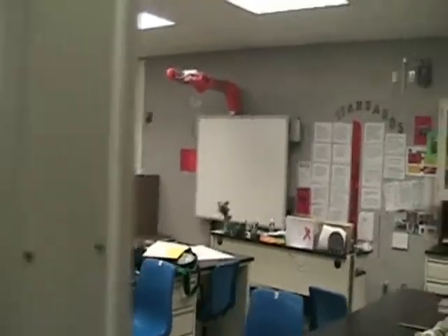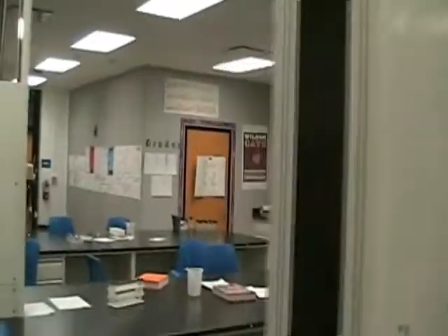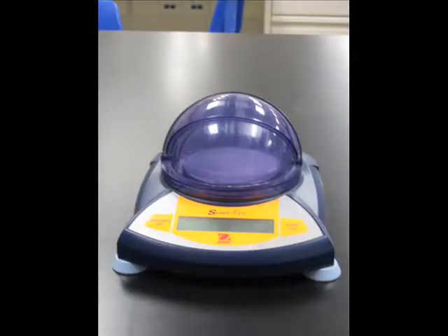Now let's get started with the training. To keep up with today's technology and simplicity, the Biotech Lab offers two scales you can choose from: the analytical scale and the tabletop balance.